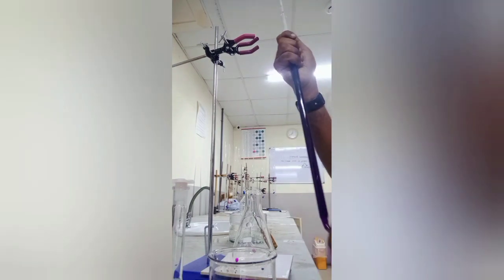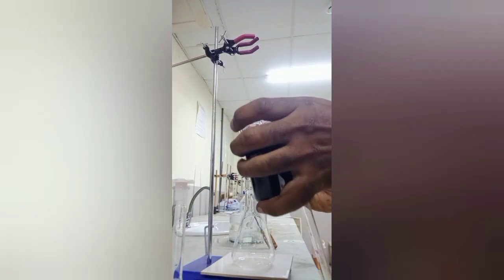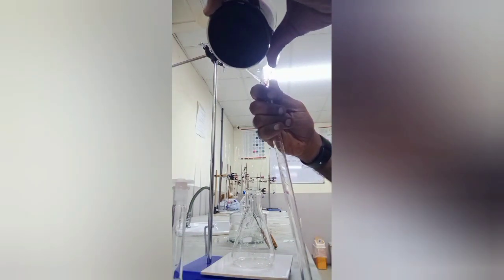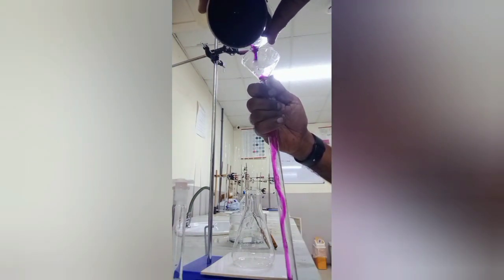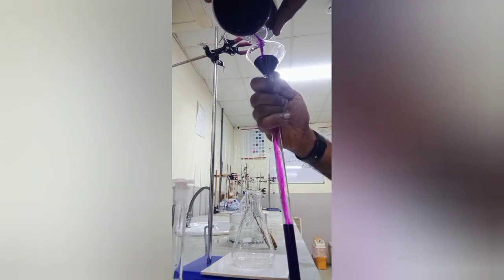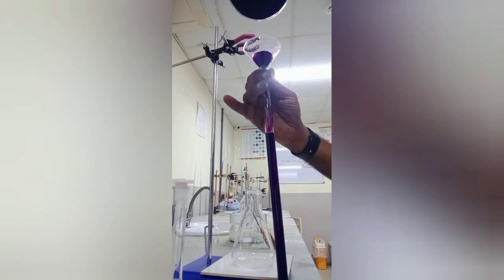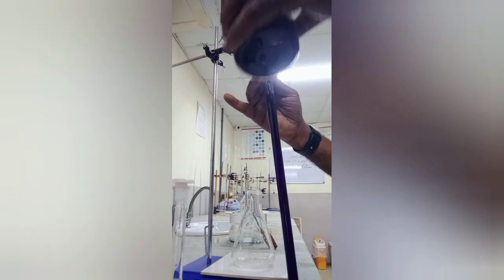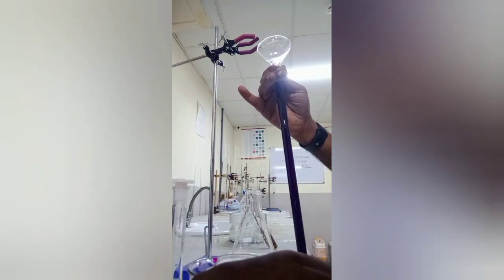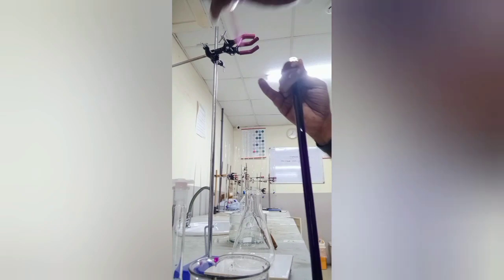Okay. For the adding method, use the funnel every time for adding the KMnO4 solution into the burette. Add slowly. Once you fill the burette, take the funnel out.